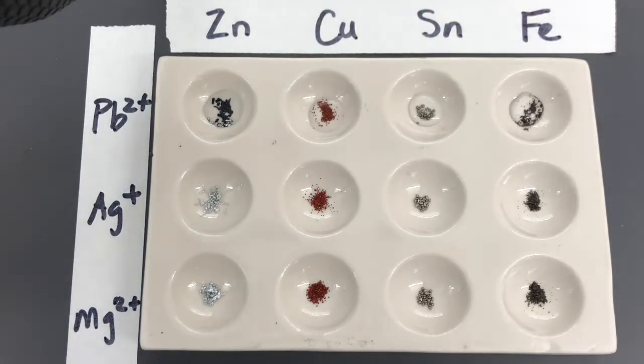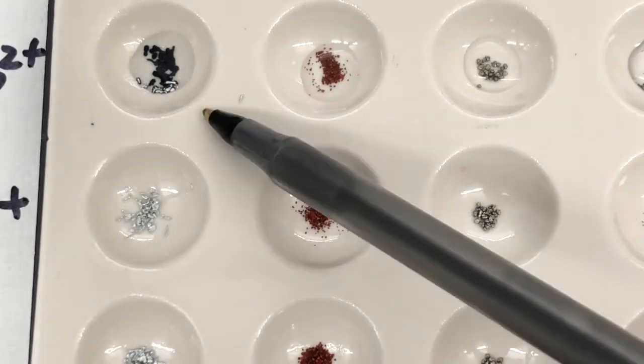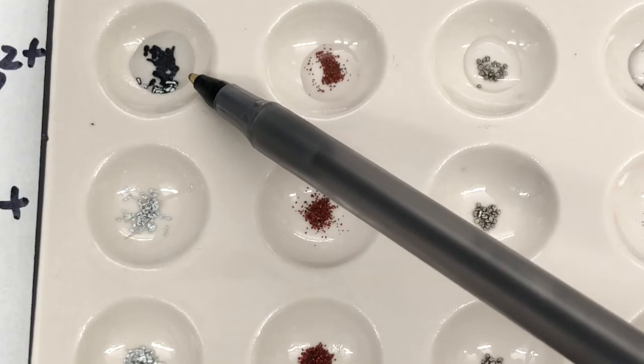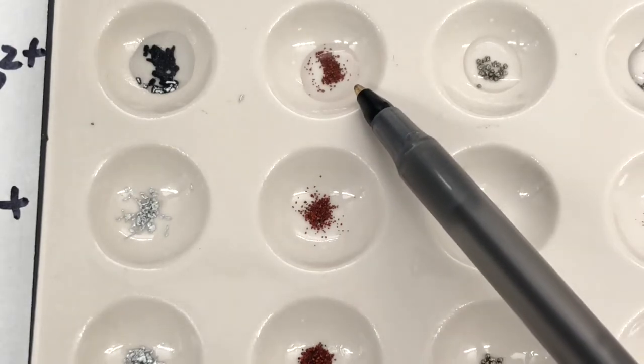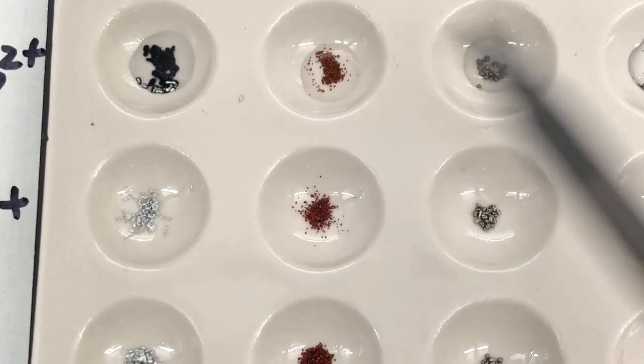So now that I've added all of those, I'm going to zoom in a little bit. Certainly you can see the shiny appearance of the zinc starting to disappear as the lead begins to form a solid. When it comes to the copper, it doesn't look like there's much of a reaction initially.